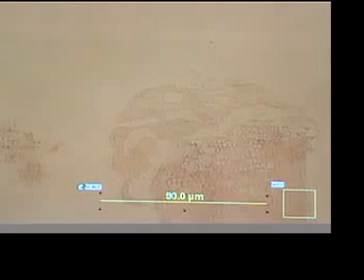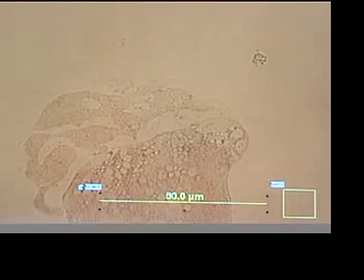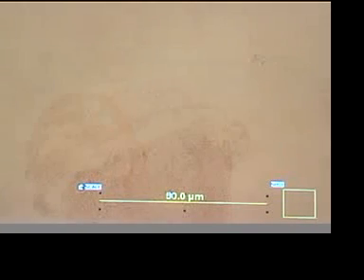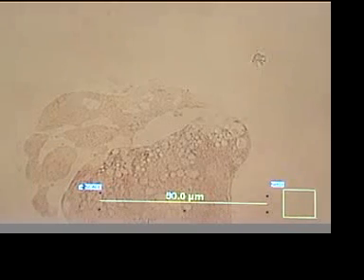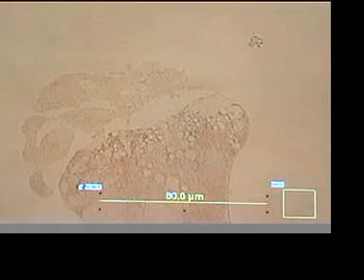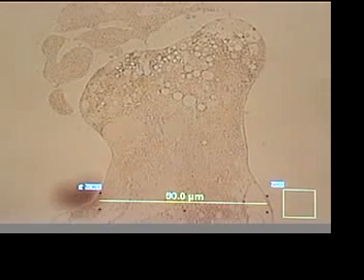This is actually a first for me. Let me see if I can zoom in on that rupture area. I believe he's releasing his contents there. And this is typically what you see by the time you get to an advanced stage of this experiment. This, let's see if it's still running.